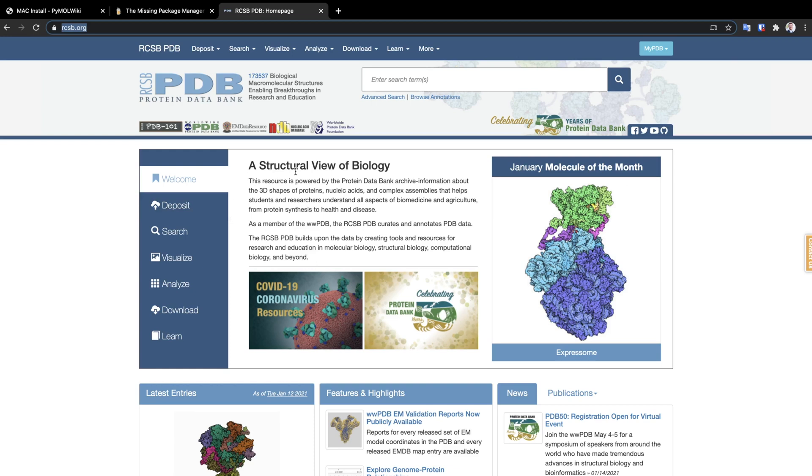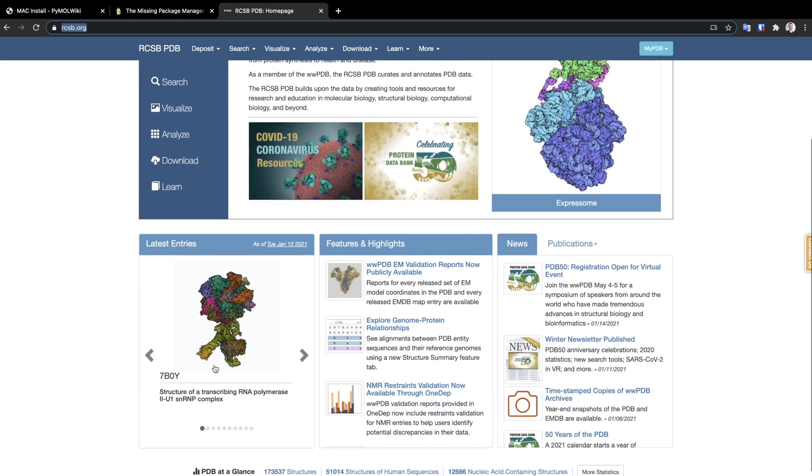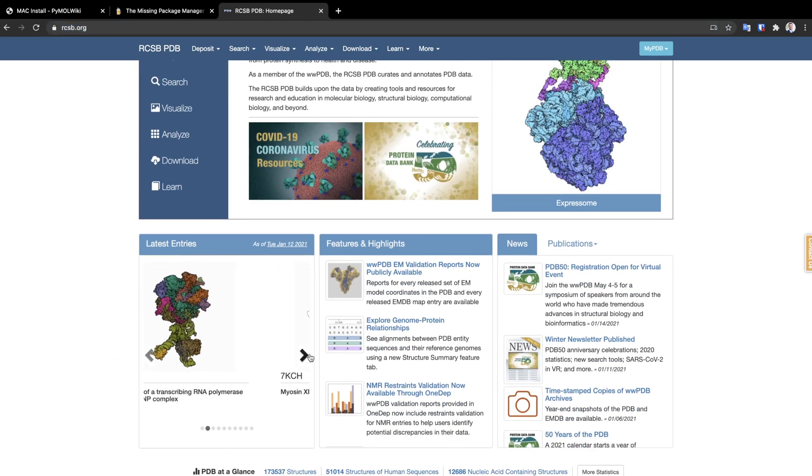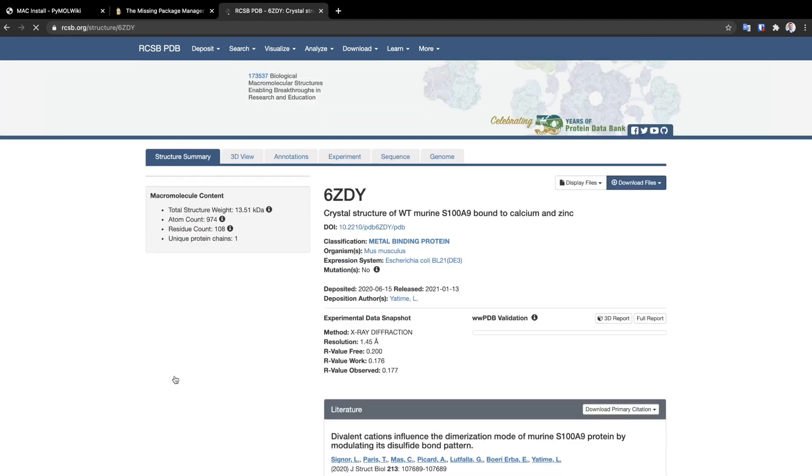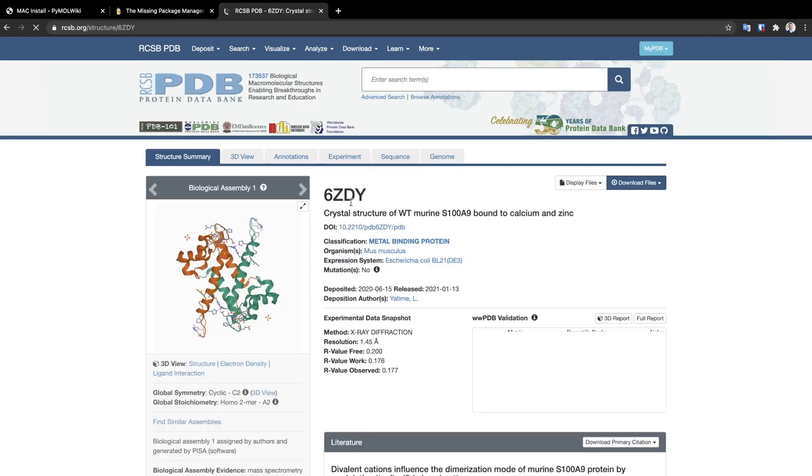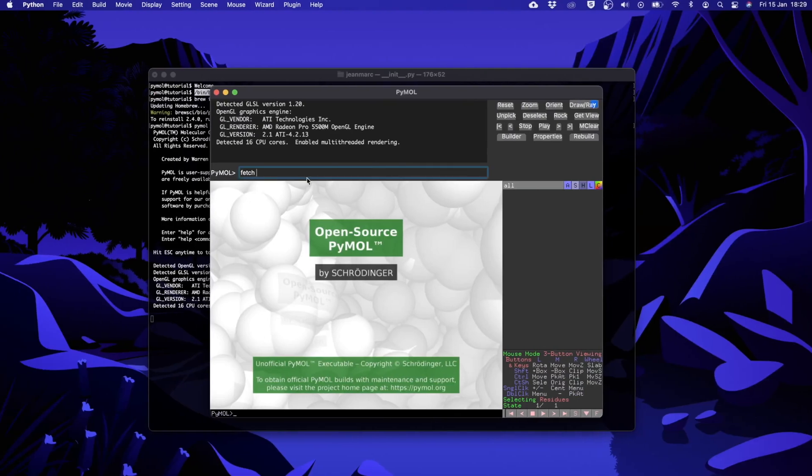But for now let's look at the latest entries and find a very simple molecule to start with. We just have to copy the code, go back on PyMOL and complete our command with the code that we just copied.